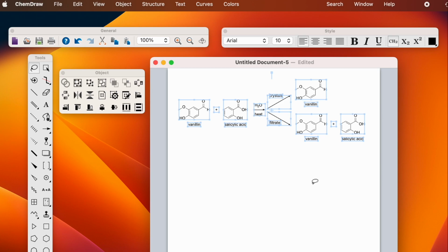The thing about the LibreOffice suite, pasting something like this would work because what it does is it sets the structure that you're pasting to the width of the page. So since we're taking up the entire width of the page, that would work really well. If you paste it into Microsoft Word, everything that you paste into Microsoft Word is going to be coordinated as far as its size. It's going to size the right way. So that's an advantage to Microsoft Word.